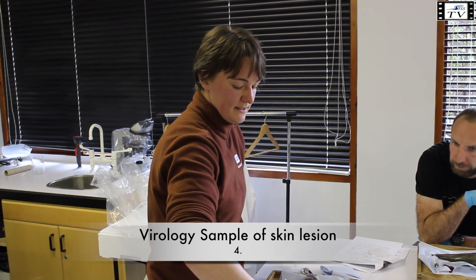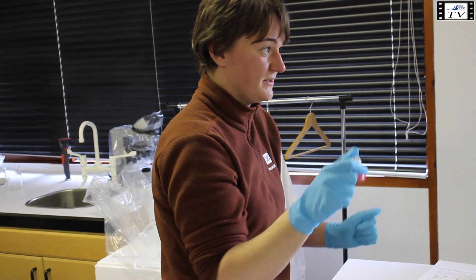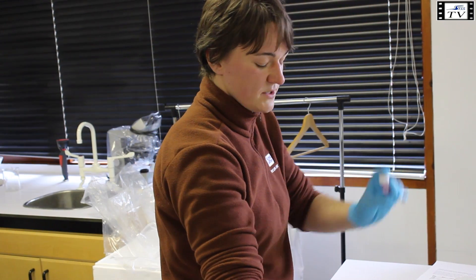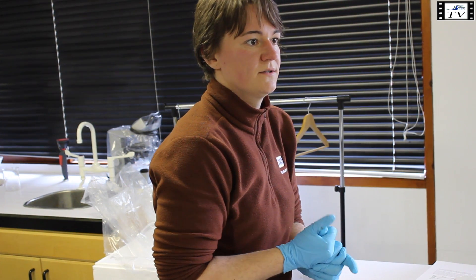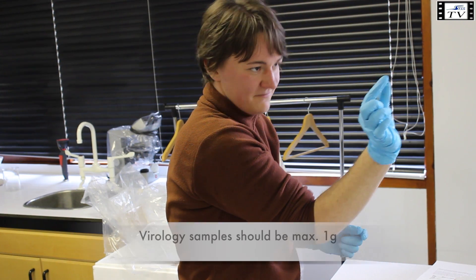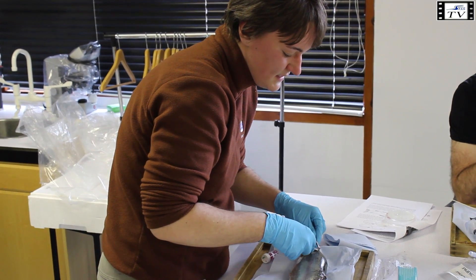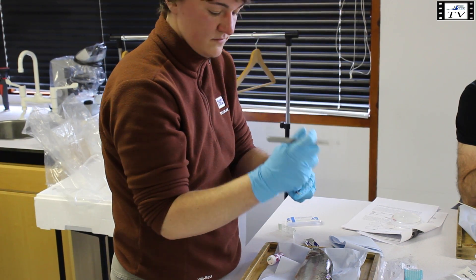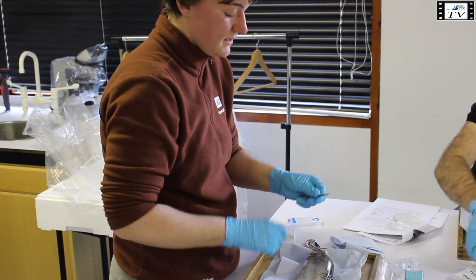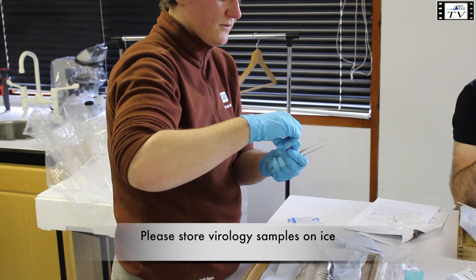Now we're moving on to virology. I have two separate transport vials per fish — one for skin samples, which are more contaminated with bacteria, and one for internal organs, so I don't mix them. The virology samples have to be quite small — ideally about one gram, so very tiny. You cut it out at the rim of the lesion. It doesn't have to be very deep because the main disease is just in the epidermis, the topmost layers, so two to three millimeters in depth is plenty. Put that in the transport media and keep it on ice.